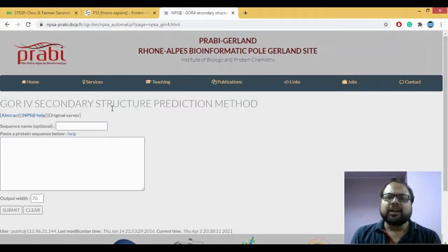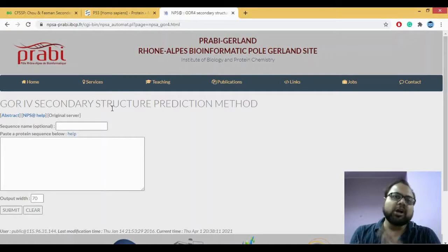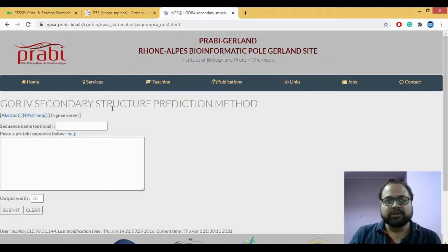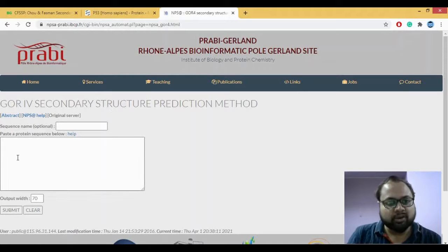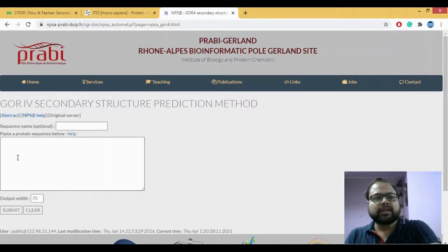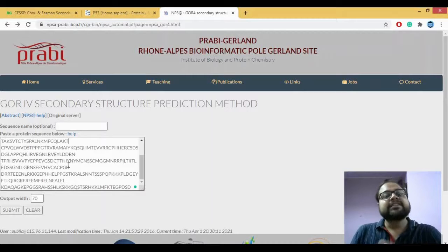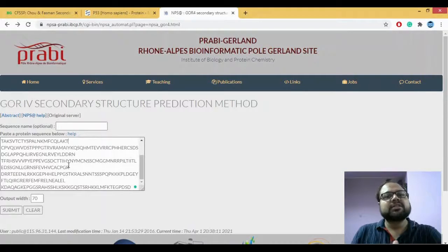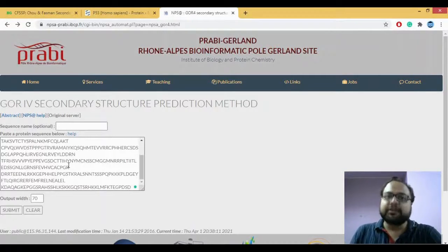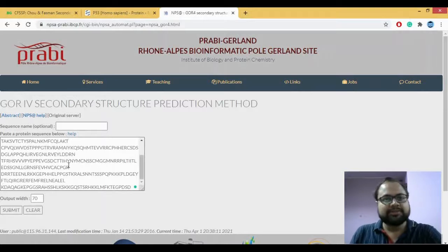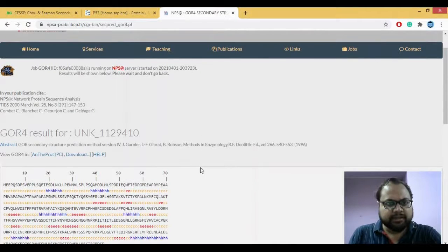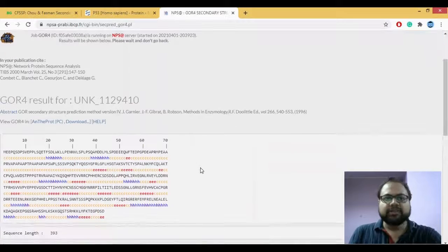Now we saw how your Chou-Fasman works. Now let's try incorporating the same sequence in your GOR and let's see what different results does GOR4 give us as compared to Chou-Fasman. I clicked on submit.